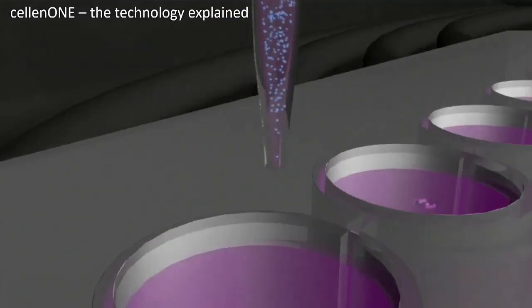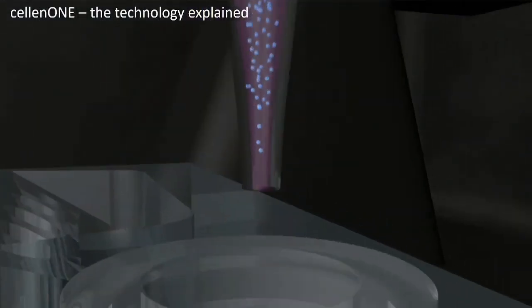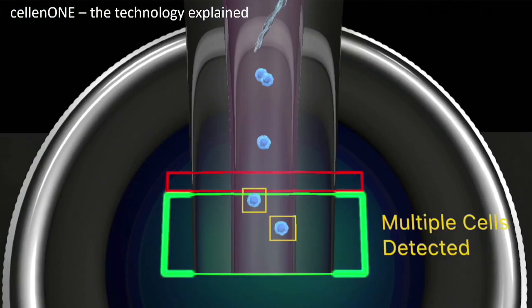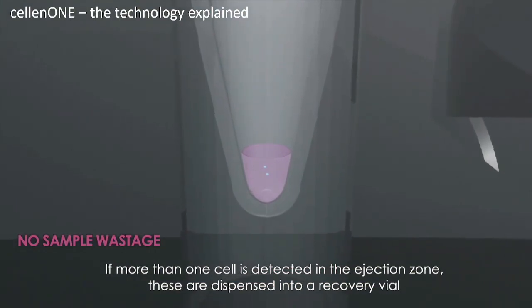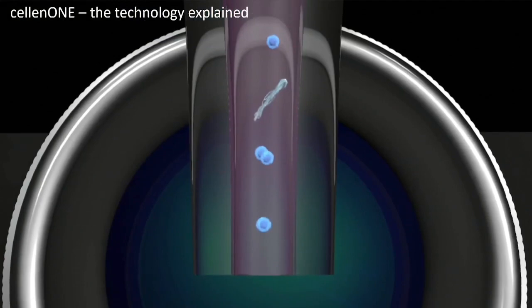Luckily, there is another cell to isolate. So after analyzing this picture, go back in A2. Back in front of the camera, no cell detected. You just discard this drop. Next one, doublets, you discard this drop, but actually you don't really discard those cells because they fall in a collection tube, so you can re-aspirate those cells if you want to be sure that you can sort every cell you have in your samples.